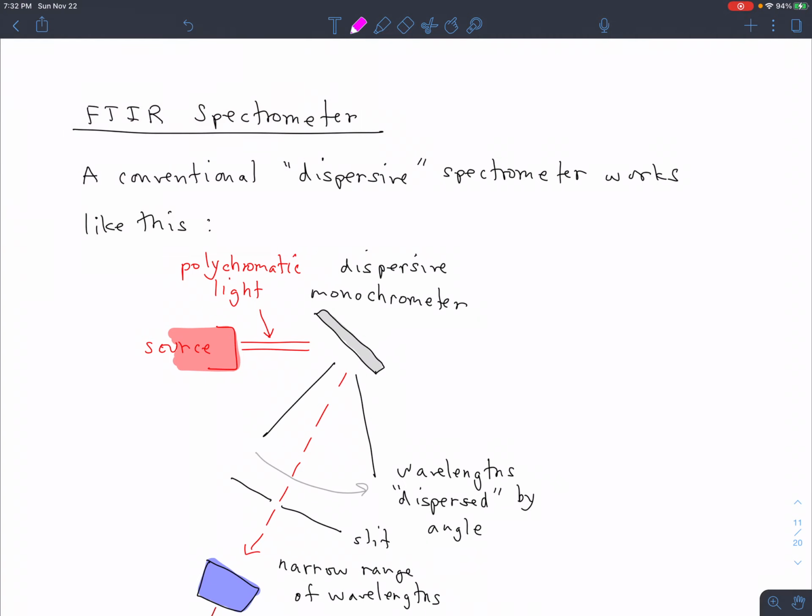Okay, week 2 of Lab 8, last lab of the semester. Last time we talked about the theory behind the infrared spectrum of HCl, and we talked about the rotational levels and vibrational levels and the couplings and the corrections for anharmonicity and for bond stretching, and how you interpret the spectrum in order to get molecular parameters out.